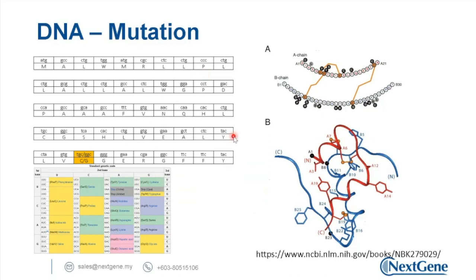Okay, so DNA sequencing technology is very important when we want to investigate whether there are any mutations or not. So we are doing some genotyping. When we want to determine the genotype of a sequence of an organism or a gene, we are actually checking the DNA sequence.